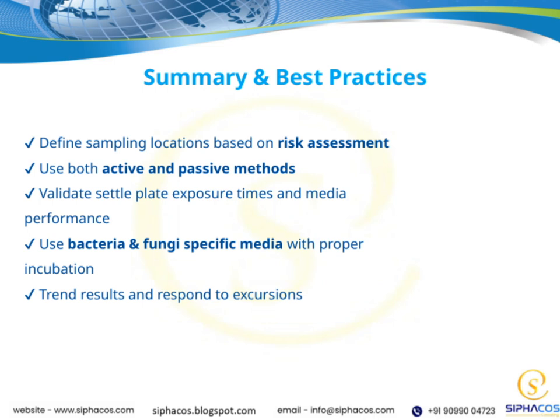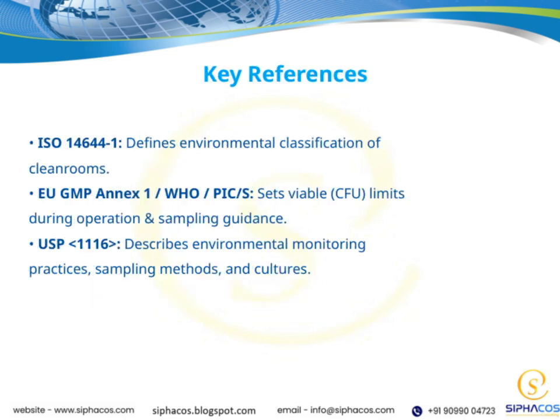Finally, trend your results over time and respond promptly to any excursions or deviations. This proactive approach helps us maintain control and continuous improvement in our processes. Overall, following these best practices will strengthen our sampling program and support our commitment to quality and safety. Let's take a moment to look at some key references that underpin our understanding of environmental controls in cleanrooms.